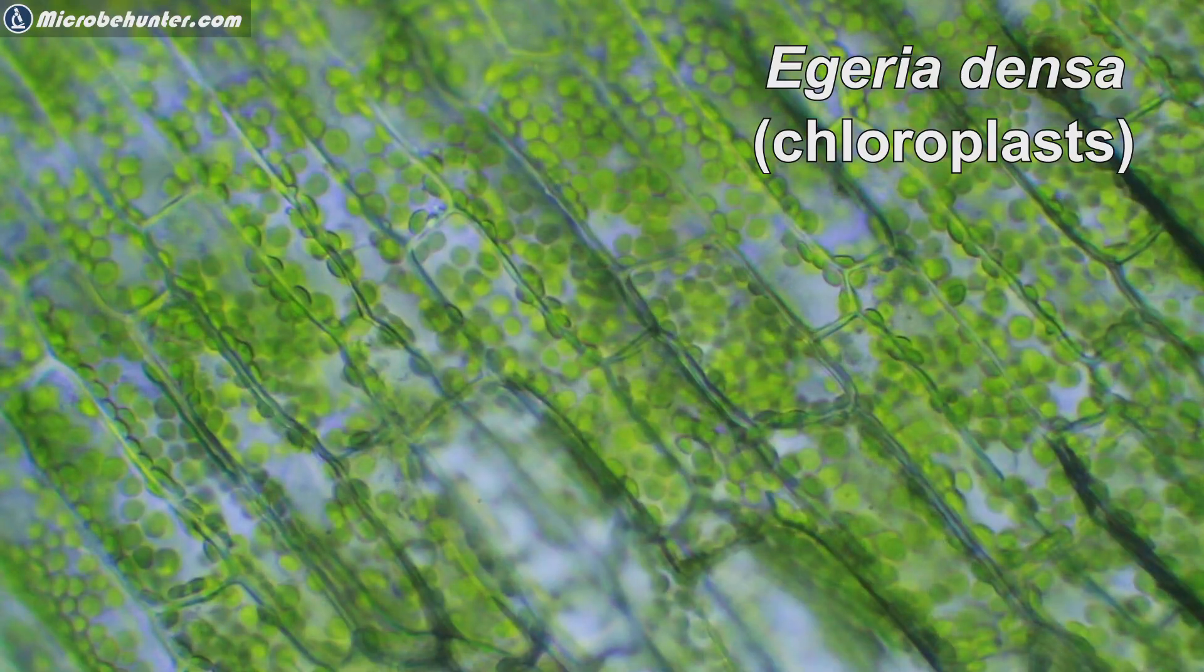This is of chloroplasts of the water plant Egeria densa. What you can see here on my wall is not a computer monitor but as a matter of fact a green screen. During the whole time you've now been watching pictures and videos that have been made using this very microscope.